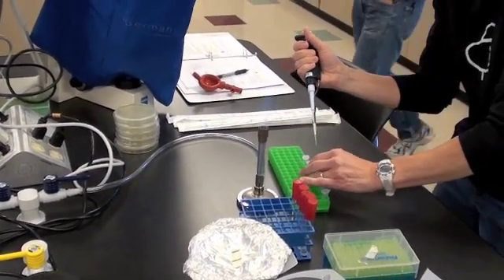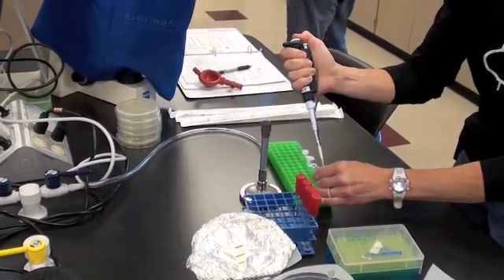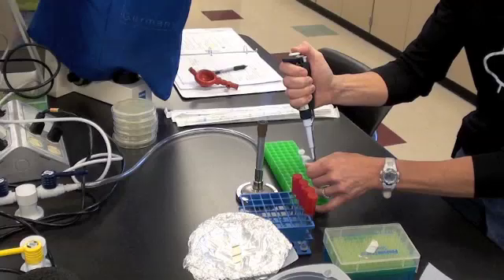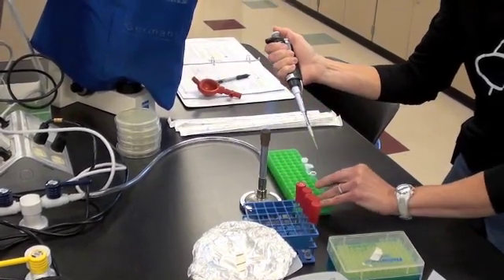She'll be taking 10 microliters from her 10 to the minus 1 solution and transferring it to another 90 microliters of phage buffer. This will become her 10 to the minus 2 dilution.